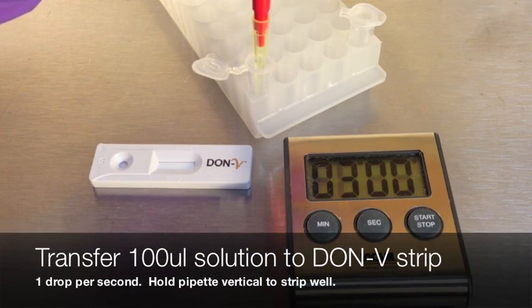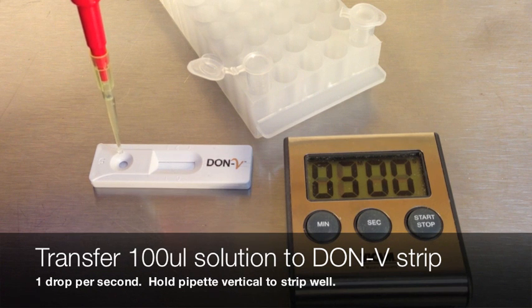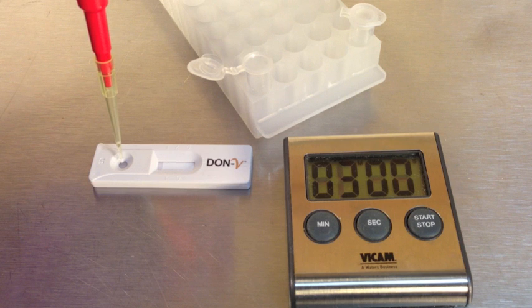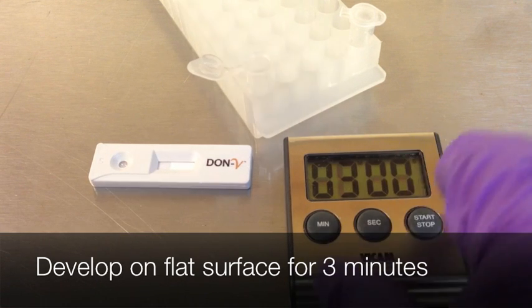With a new pipette tip, transfer 100 microliters of this mixed solution to the circular opening of the Don V Test Strip, dropping 1 drop per second. Hold the pipette straight up and down. Develop the strip for 3 minutes on a flat surface.